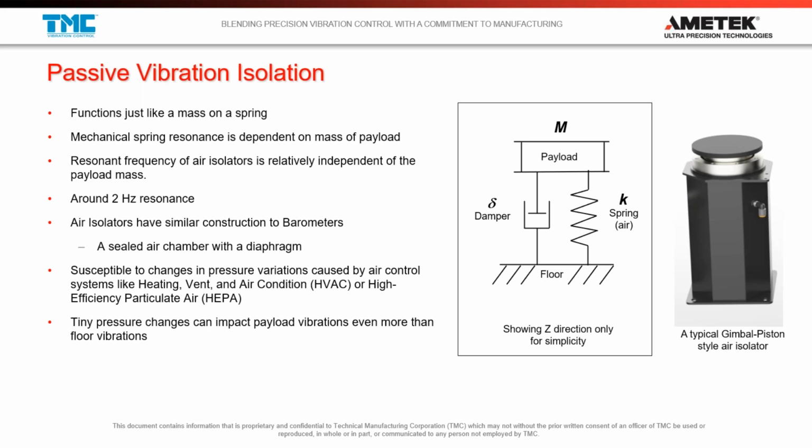And air isolators do a very good job of isolating, and they're used in many of the precision tools that we've talked about in earlier slides. They're a little bit susceptible to changes in pressure, though, because as room pressure changes, this being a sealed air chamber, you're going to have the ideal gas law want to expand your air inside the isolator as the pressure in the room decreases, or vice versa. And as you have pressure changes in the rooms due to maybe doors opening or HVAC systems turning on and off, or an elevator going up and down a shaft, this could be a problem with a sealed air chamber design such as this.